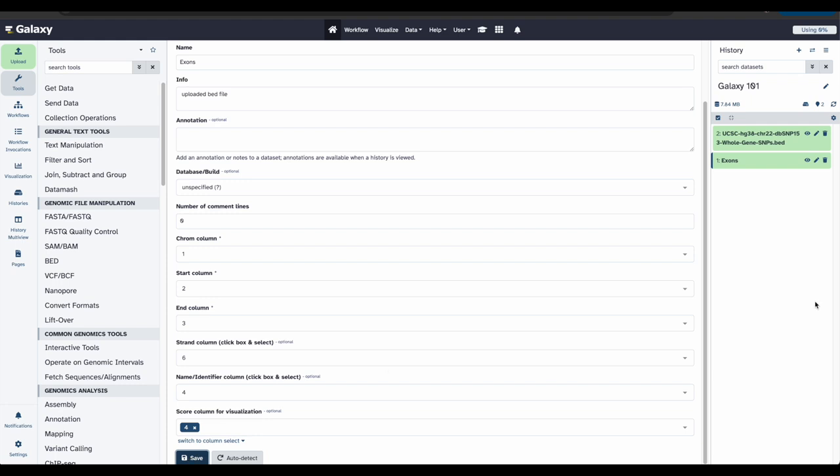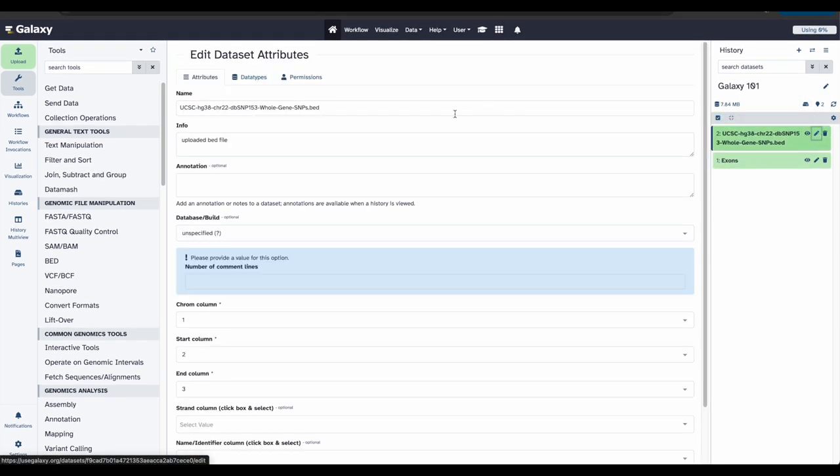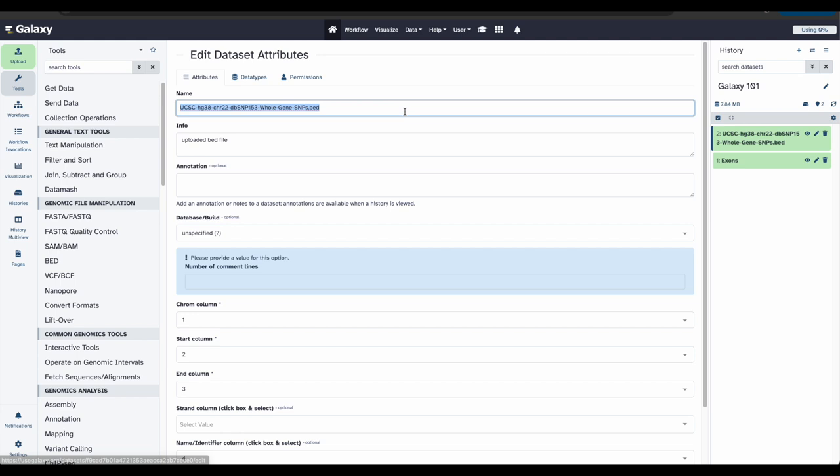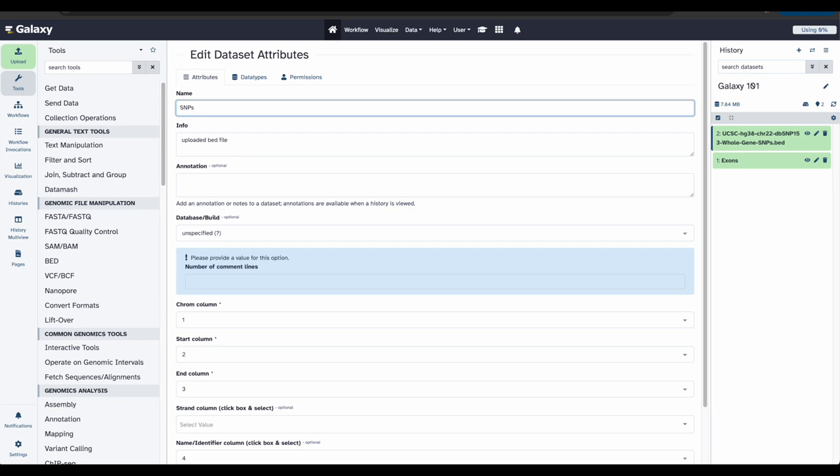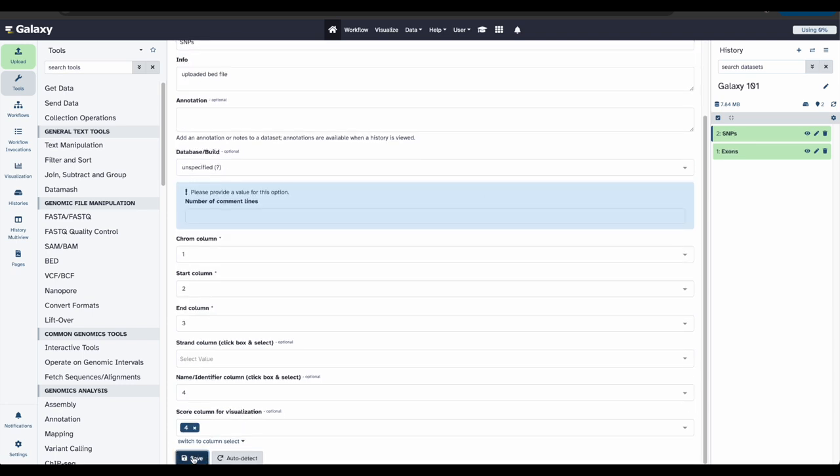Let's do the same thing for the second data file. Again, go to the second data file, click the pencil icon, and we can update the name field. This time, let's name this data file snips. Scroll down and click save. Great, we're off to a good start.